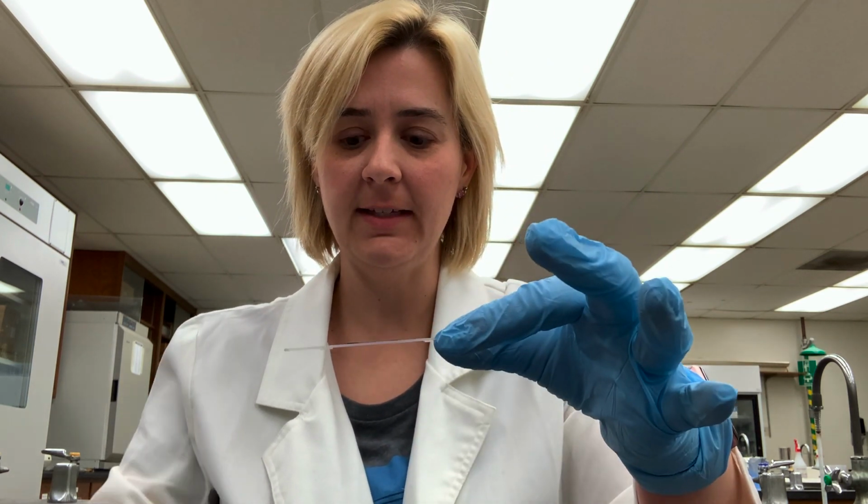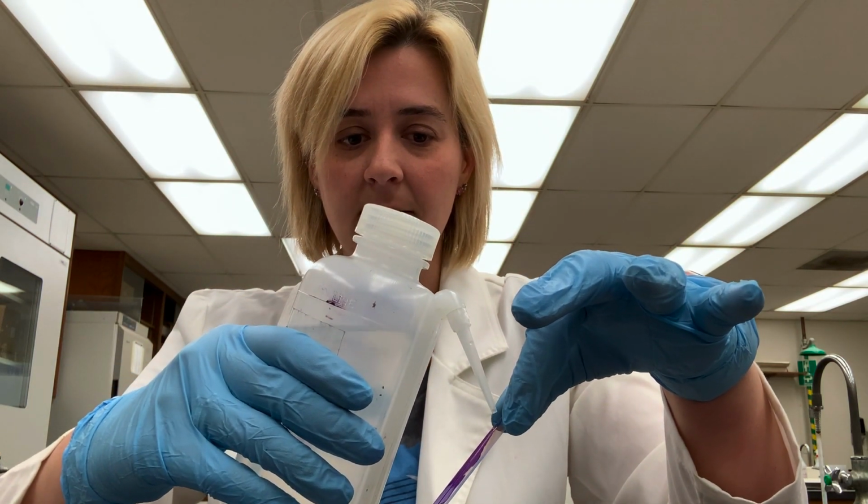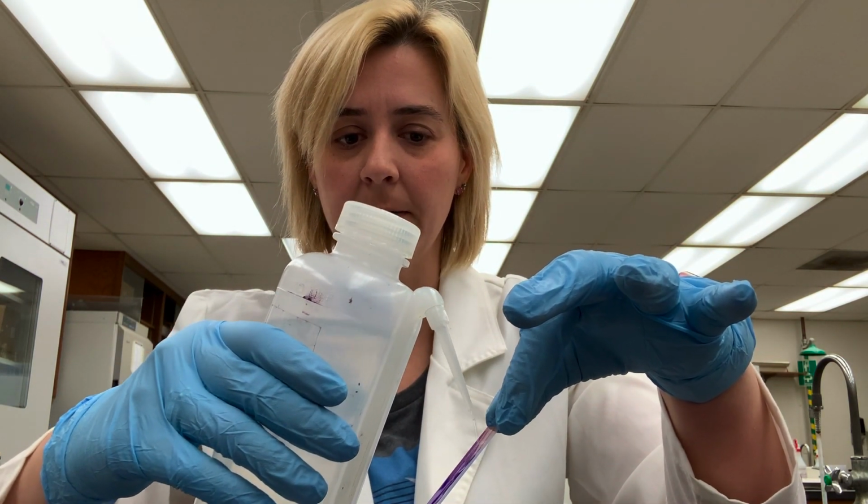I'm actually going to cut the minute wait out of the video, but I am currently waiting for 1 minute. So it has now been 1 minute. What I will do is I've got my slide and I've got my tray where I'm going to collect all of my stain waste. Once I'm done doing all my staining, I will dispose of that waste in the appropriate chemical waste container. For now, I'm just going to collect it all into the tray. And then I take my slide and I rinse with deionized water.